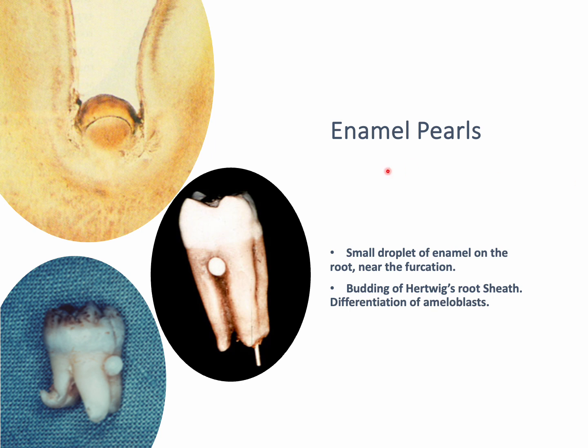So by this part we have ended the practical session of enamel histology. I hope you liked it.